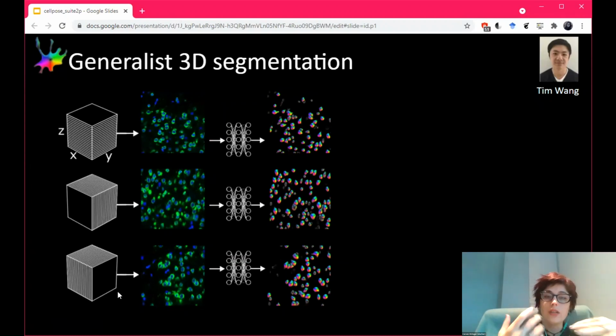Having 3D information helps with segmentation generally, because you have more information on which cells are on top and below each other. Now we can actually learn cells that are kind of surrounding each other, because we have this 3D information. Like what we were talking about before, they would be split in 2D, but in 3D we can actually find these more complex processes.